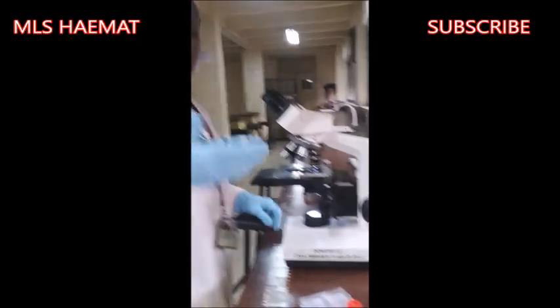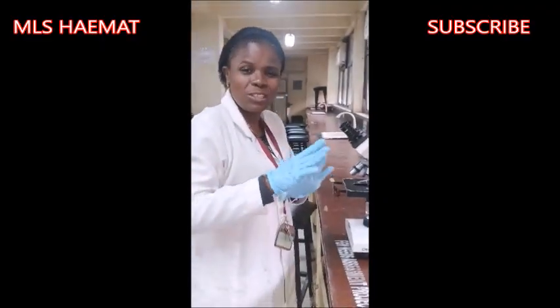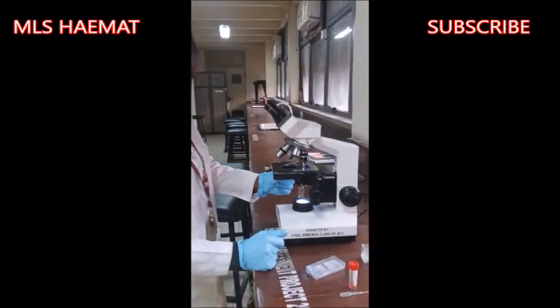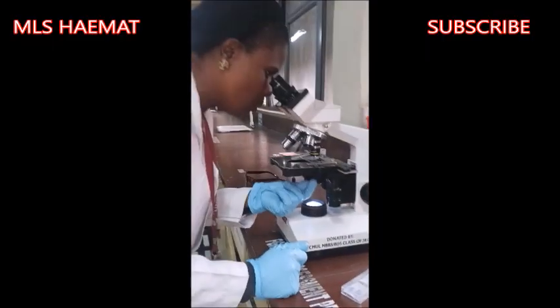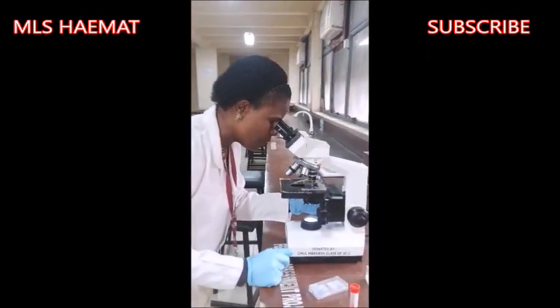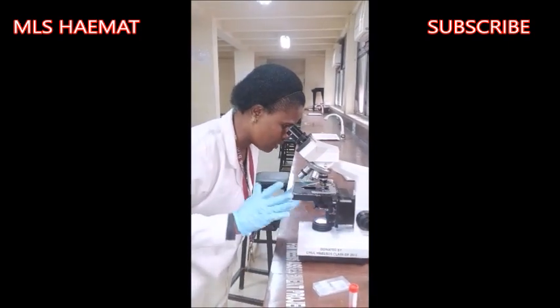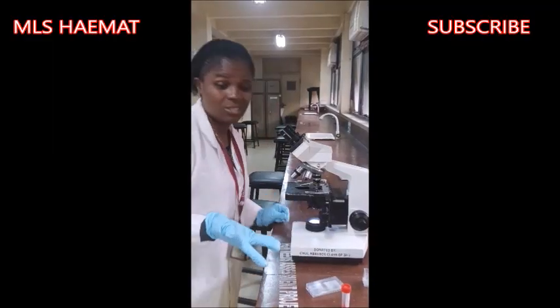But you should know that with ×4, ×10, ×40 objectives, you don't need much light. So in this case, I'm going to close the diaphragm. I've reduced the light by closing the diaphragm. Even the condenser, I've lowered the condenser. So with the ×10 objective lens, I can see it clearly, but the cells are very small.